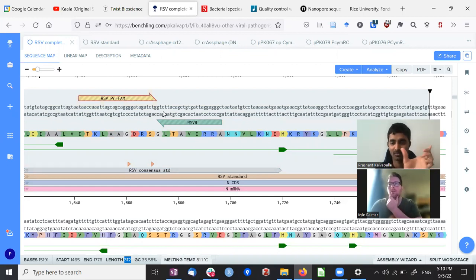Or if someone else in the lab wants something else, you can put your fragment and their fragment next to each other. If they're both meant for standards for PCR or ddPCR, you can both use the same thing independently. That's one thing I'm doing right now, where we are fusing multiple fragments and then ordering. You can save a lot of money, both shipping and manufacturing.